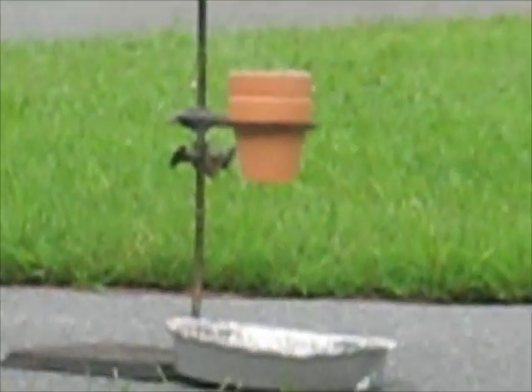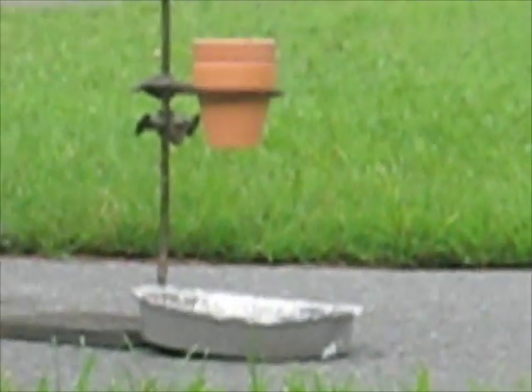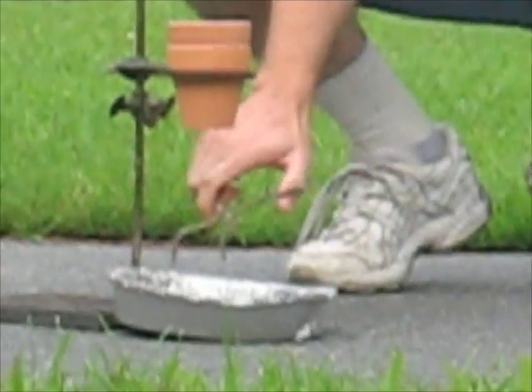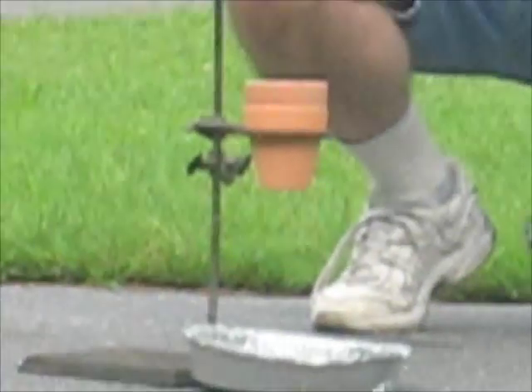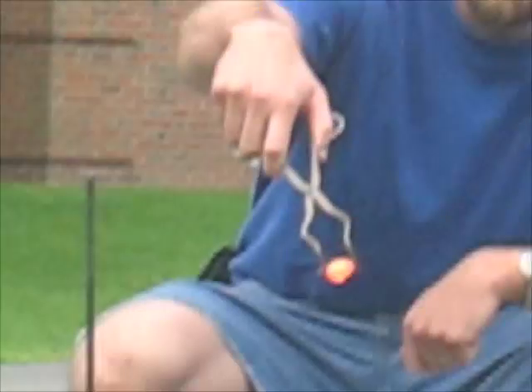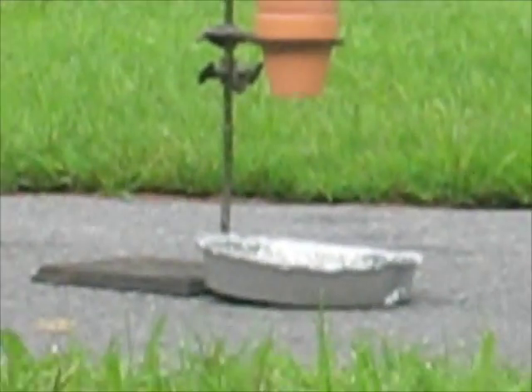That didn't work. Okay guys, look at this — that's molten iron, or was recently molten iron. In fact, the middle of it's still a liquid. And you'll notice in the video that the flower pot broke. It's that hot.